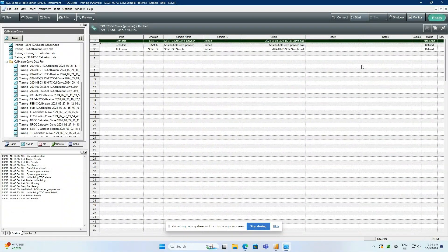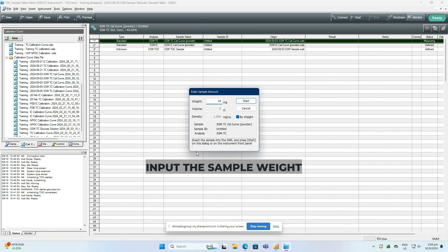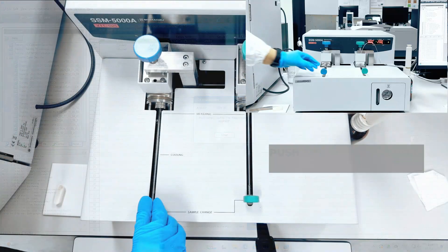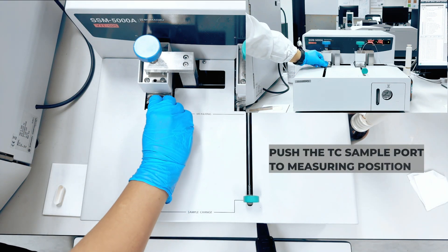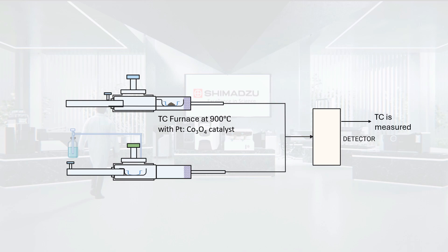In the LabSolution software, click the Start button, input the measured sample weight, and click Start again. When the instruction window appears, push the TC sample port to the measuring position. When the sample boat is pushed into the furnace compartment, the sample is combusted at 900°C to release carbon dioxide and water. The amount of carbon dioxide is detected and measured, and the TC value can be obtained.